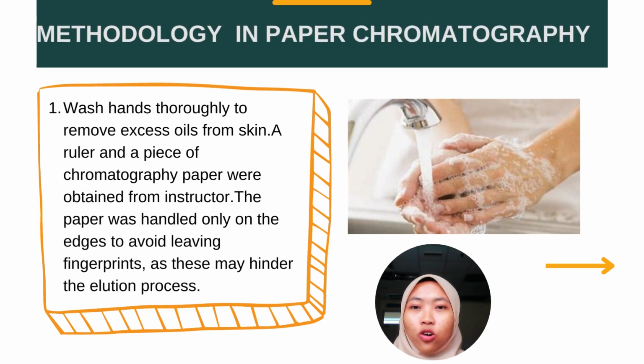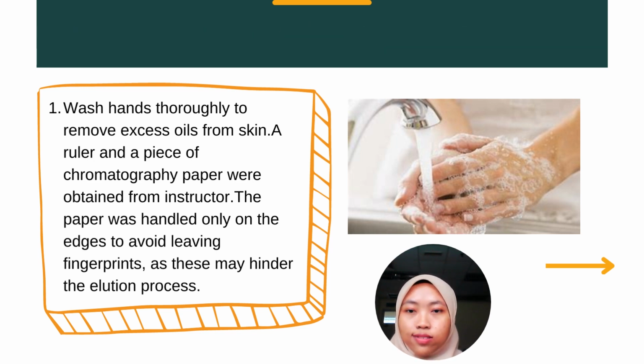So the first step is to wash hands thoroughly to remove excess oils from skin. A ruler and a piece of chromatography paper were obtained from the instructor. The paper was handled only on the edge to avoid leaving fingerprints, as this may hinder the elution process.